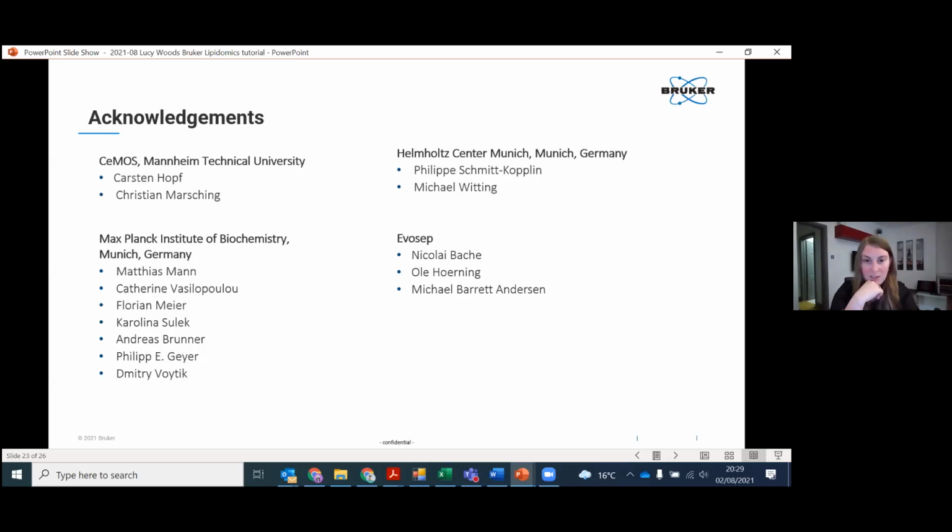So we typically see a deviation of, I'd say, less than 2%. The majority of the time it is less than 1%. And that's the same if we look at reproducibility across different platforms. For the CCS value, we've compared it between different timsTOFs and different drift tube platforms, and for that we'll typically see around a 1% deviation. And then if we look at predicted values, it's typically under 2%. Oh, that's pretty good, actually.